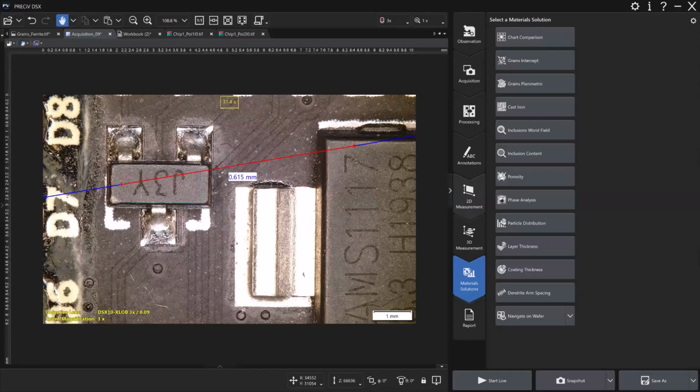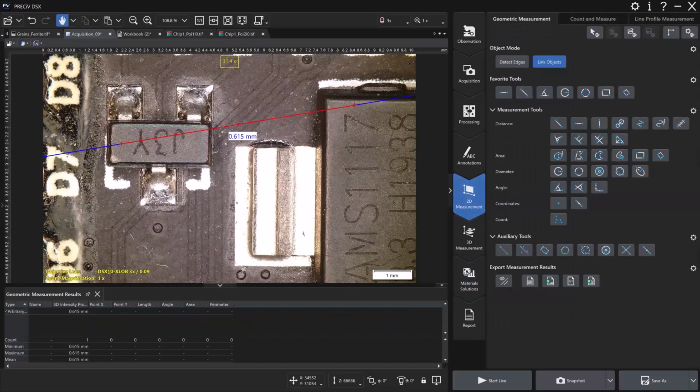I've had a customer meet some of the demands of the CFR by exporting measurements directly to text documents, where they automatically import into their secure database system. But the software in general doesn't, because the measurements can still be selected and deleted, and that's the main thing they don't want.